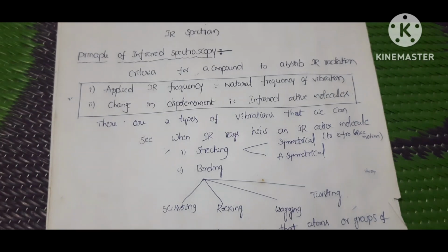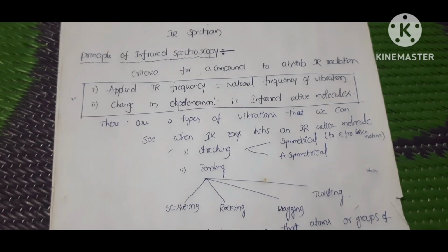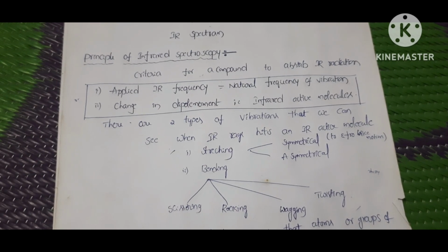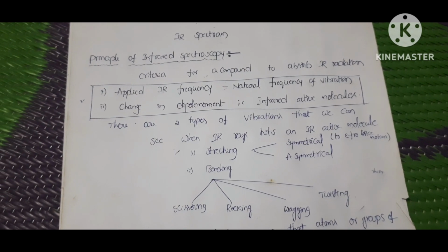Yes, the principle. Atoms in a molecule are linked with either single bonds, double bonds or even triple bonds. The principle depends on how those molecules behave when exposed to the IR radiation. If we consider any atom or molecule, they link with bonds, right? Those bonds are not permanent.